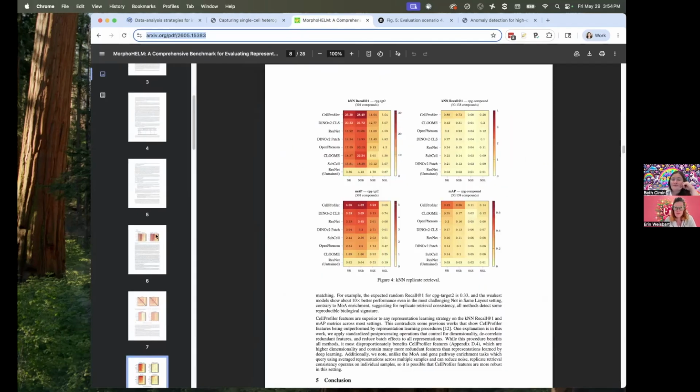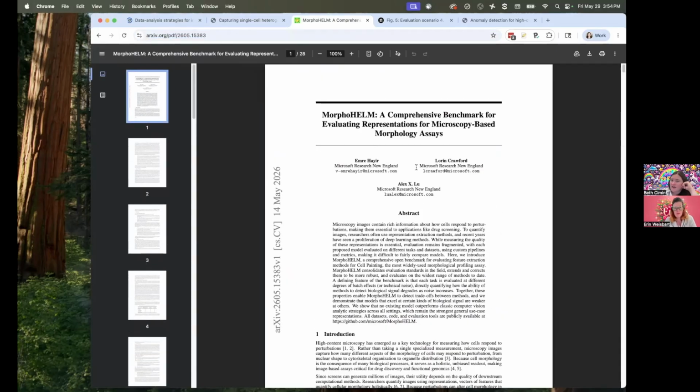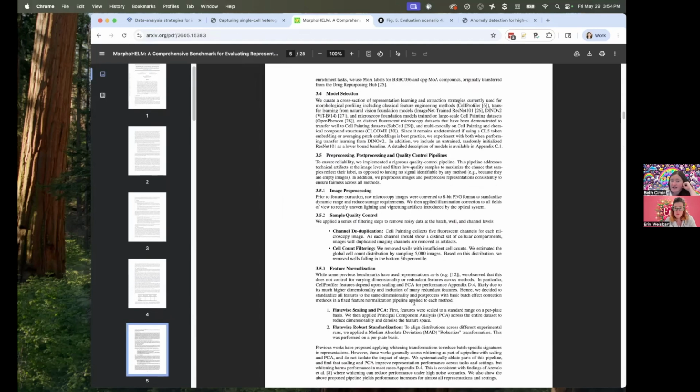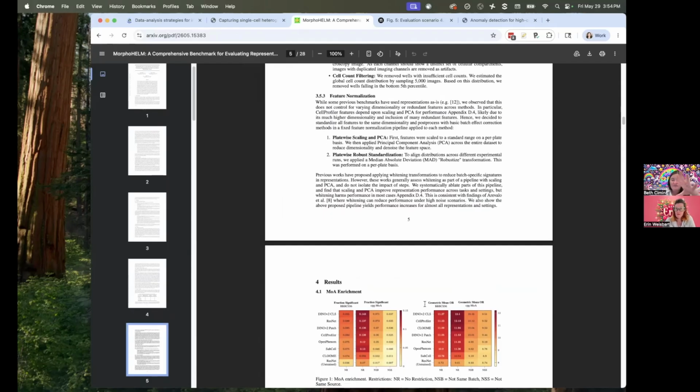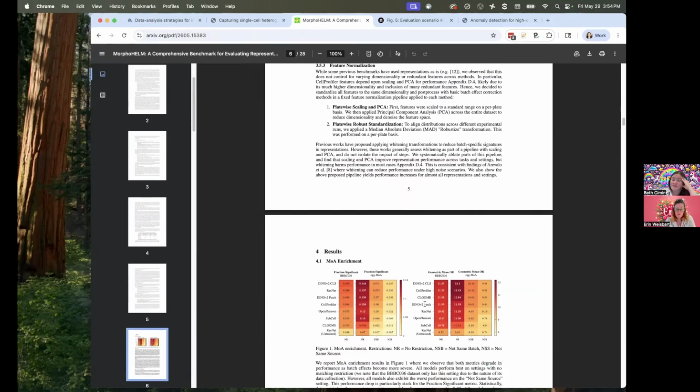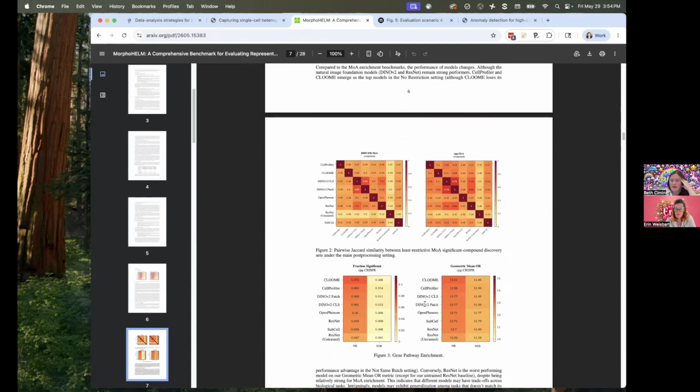This is a recent paper from Alex Liu's team at Microsoft, and what they said is, in their case, PCA helped a lot by just saying, okay, let's forget about the individual features for the purposes of making clusters, because really what we care about is the clustering and not so much the individual features. And so we will do principal component analysis, which will allow us to say these sets of features all report on similar things. And rather than worrying about the distribution of any of them, we will just look at principal component analysis.